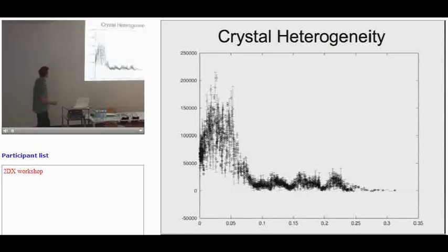And what I just talked about at the very beginning is that if you have a heterogeneous sample with diffraction, it's very difficult. Even though you have hundreds, in some cases thousands of spots, it's very difficult to segregate the different diffraction patterns just on their own, because there's no reference. You don't have an image to look at to say these two images are the same. You can try to put two diffraction patterns together, but they're never going to have the same tilt and tilt angle. So this is what happened with my most recent project, is I tried to merge diffraction patterns, and I ended up with this very large smear in the low resolution range, and the high resolution range you can see isn't too much better.